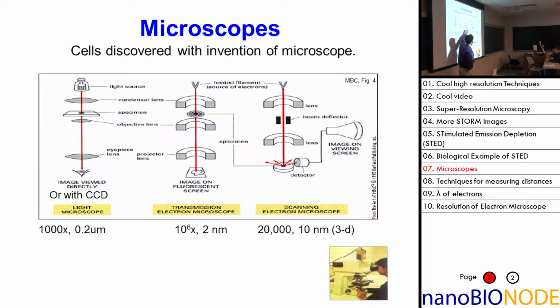In particular, you have the light microscope. Essentially, the same is true for a transmission electron microscope. This is a transmission visible microscope. You have a light here, you have a specimen, you collect the light, and you detect it. Exactly the same thing is a transmission electron microscope. The only difference is instead of a regular light source, you have what is basically a heated filament.